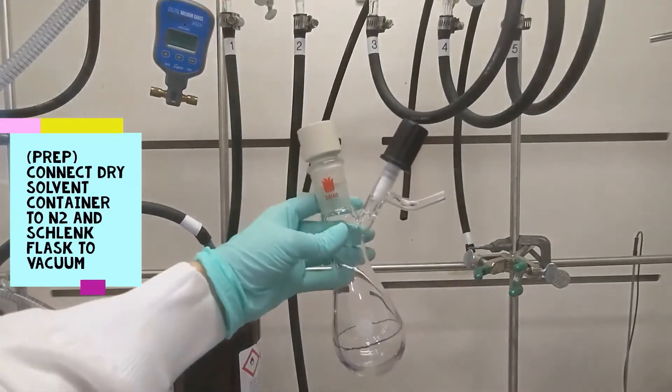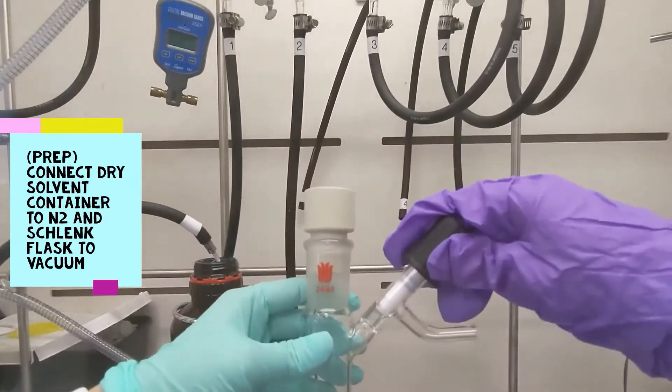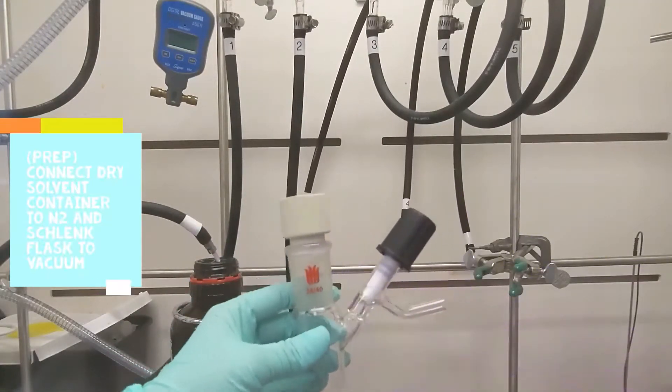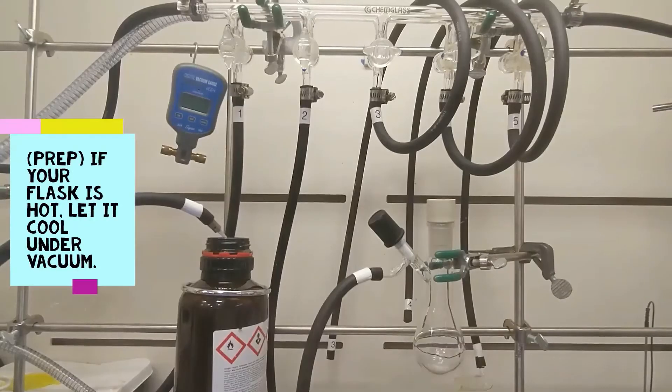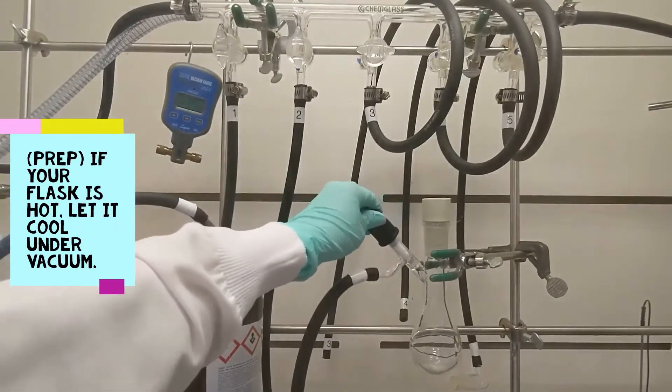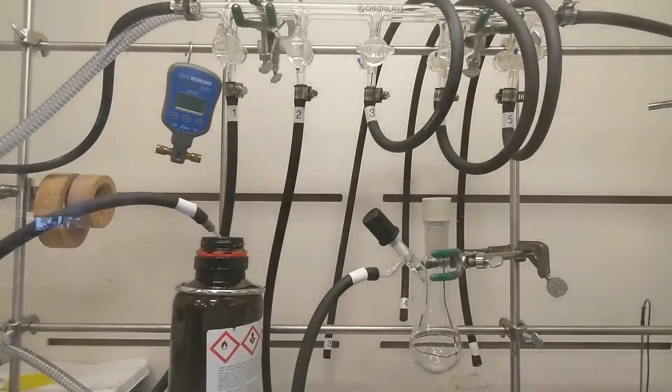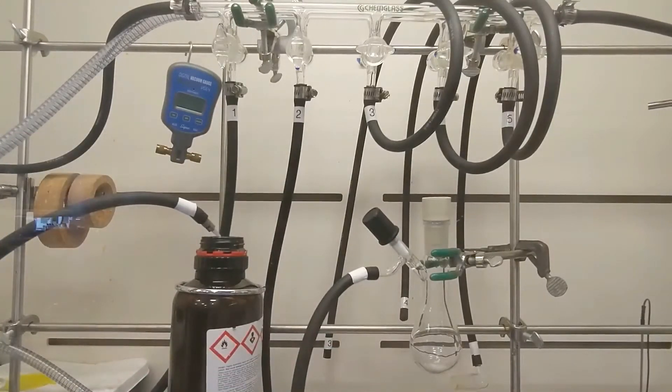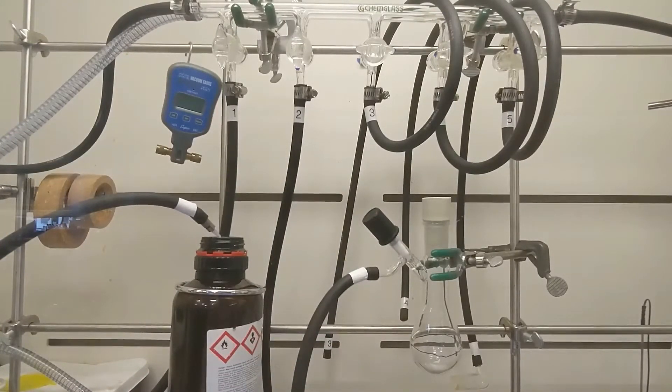So first, take your oven-dried Schlenk flask and make sure that your flask is properly sealed with a tightened stopcock and septum. Connect the Schlenk flask and dry solvents container to your Schlenk line. Here the solvent is under nitrogen or positive pressure and the flask is cooling under vacuum, negative pressure.